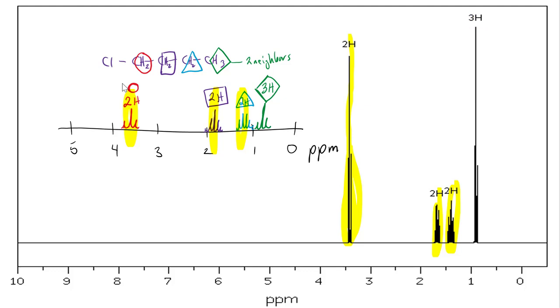And the splitting of those is tricky to see because of the resolution of the picture of the spectra as well as the resolution of the NMR from which it was taken, but we can see that we've got a good match here to our prediction.